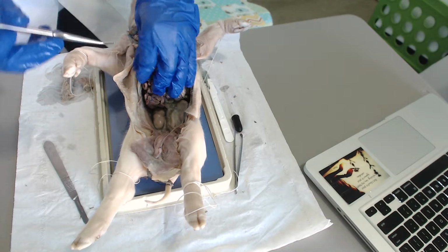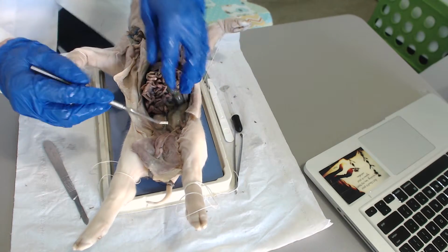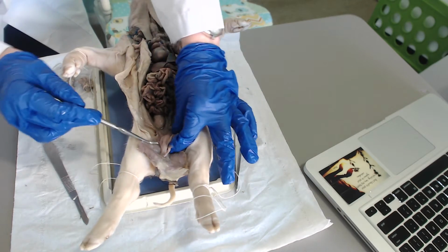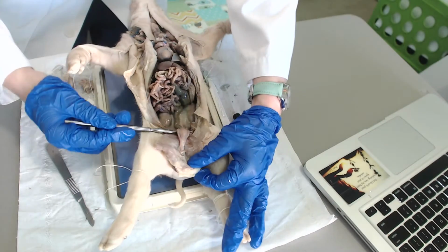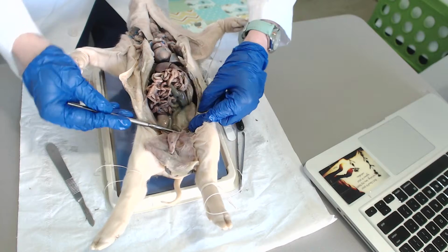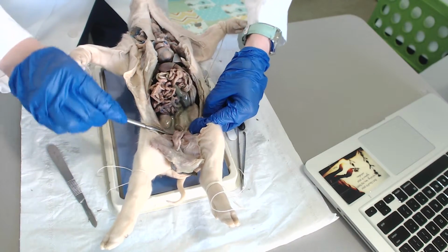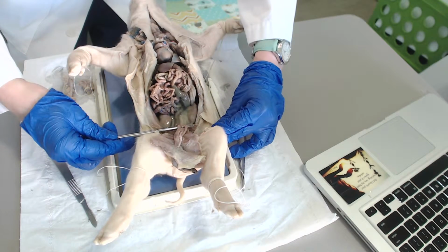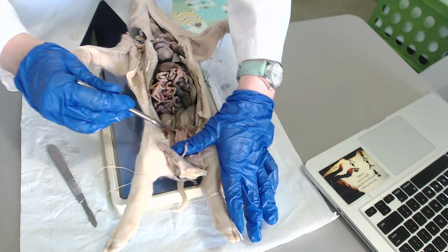And then you have the urinary bladder. So you're going to find the urinary bladder right here. This is the urinary bladder. You can kind of see the shape of it. Okay, and the ureters. There's going to be 1 on each side. Right here, the ureters. They lead into the bladder.